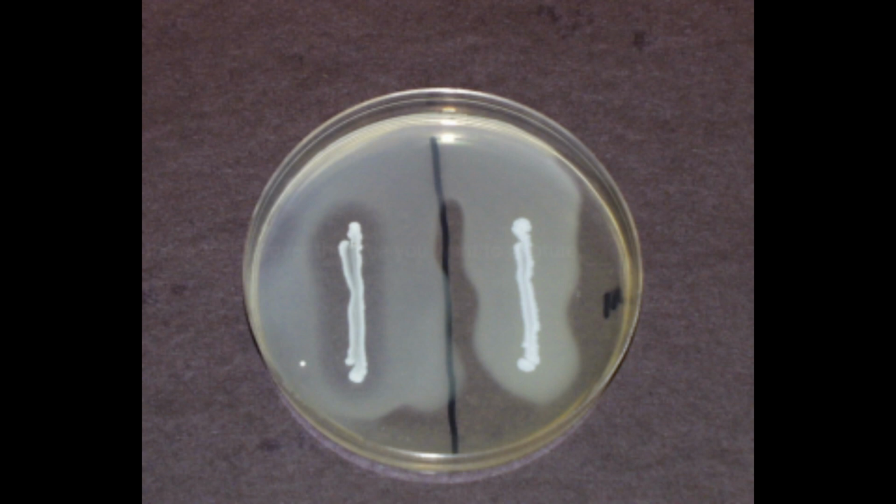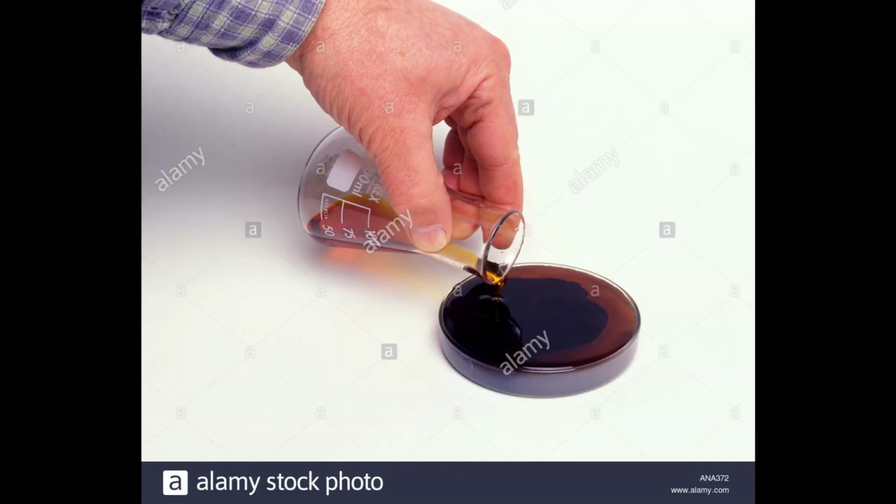After 48 hours, we will observe bacterial growth on both sides of the plate. Now we add Gram's iodine solution, normal Gram's iodine solution, generously on this agar plate, and wait for 10 to 15 minutes for the reaction to happen.